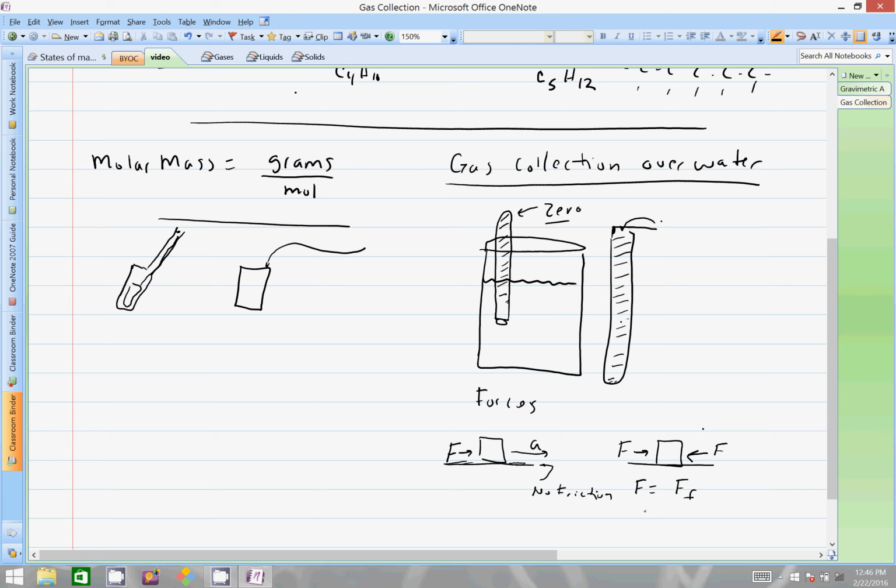This is occurring inside this tube. Now you'll notice that in the tube here we have this water above the tube. That is caused by a downward force due to gravity. I mean, if I took this tube out of the water and just simply held it over the air like this, and the water didn't just flow right out, you would probably be dumbfounded and shocked, right?